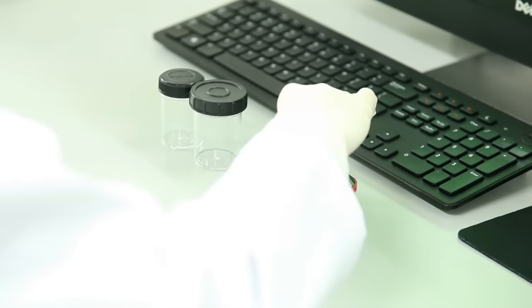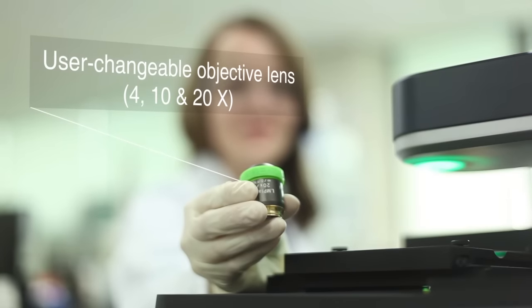Three kinds of objective lenses are available for Julie Stage. Users can change the objectives manually.